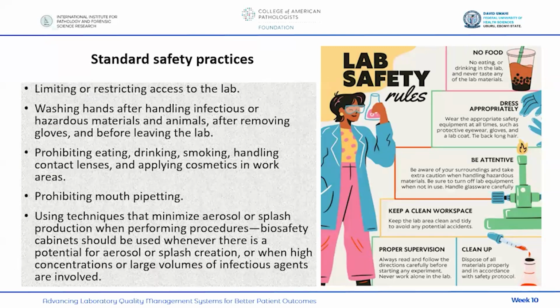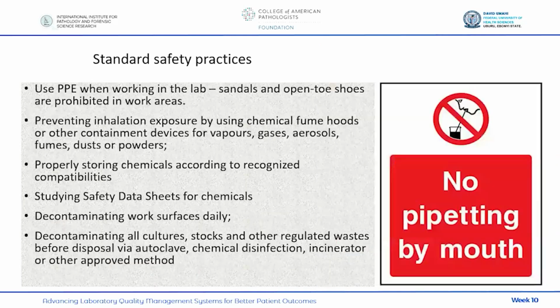Be aware of your surroundings. Take extra caution when handling hazardous materials. Be sure to turn off equipment when not in use. Handle glassware carefully. Keep a clean workspace. Proper supervision, clean up. Okay? Of course, you are expected to use PPE whenever you're working in the laboratory.